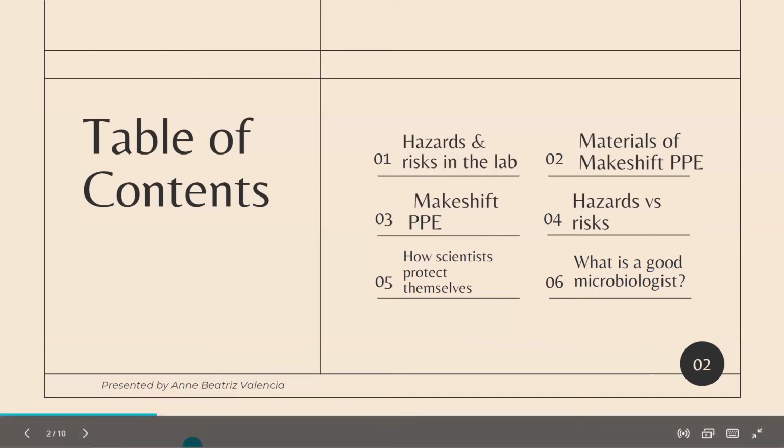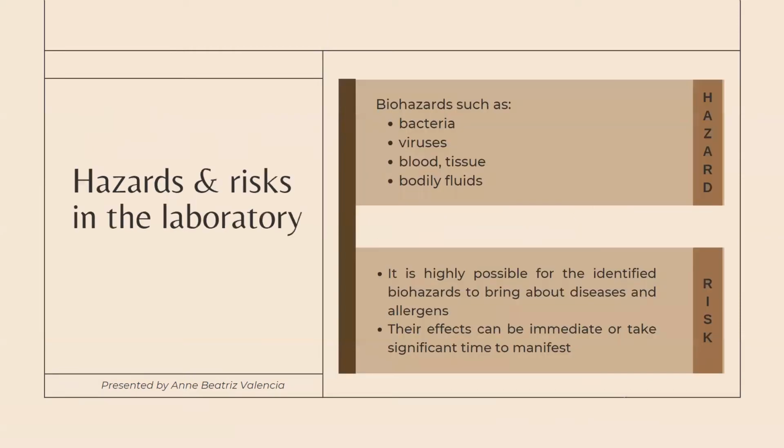To start, the microbiology laboratory presents the hazard of exposure to infectious agents or biohazards. Biohazards are biological substances that may present a health risk to humans. The use of bacteria, viruses, blood, tissue, and or bodily fluids in the lab can lead to potential biological hazards.